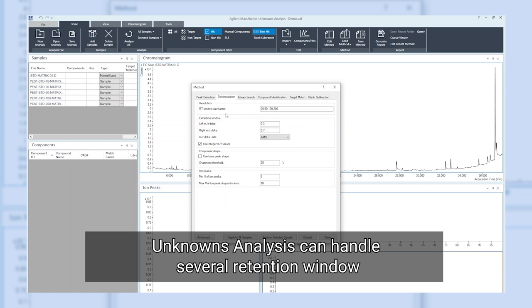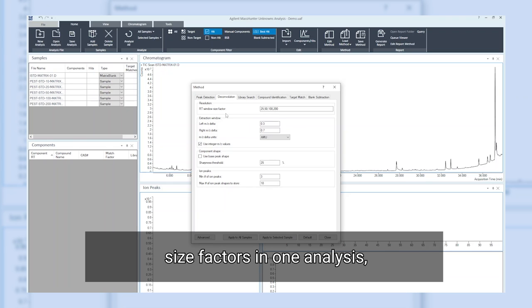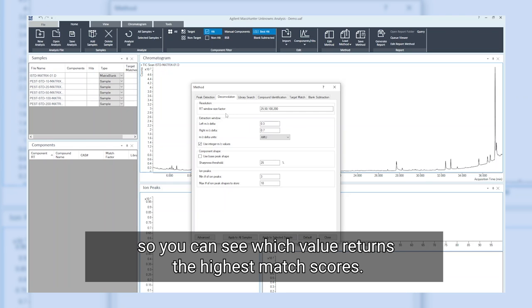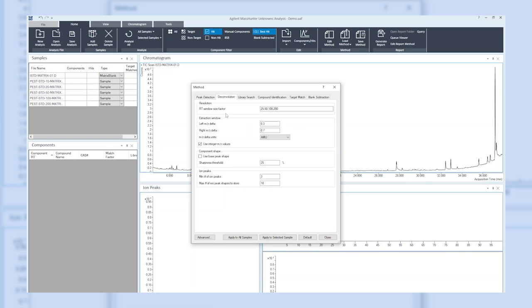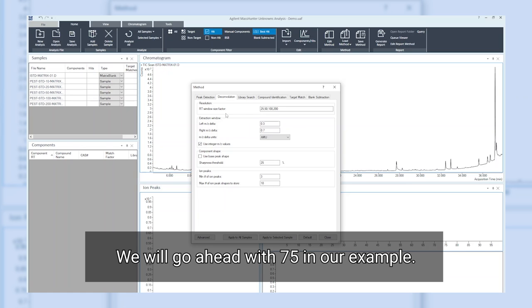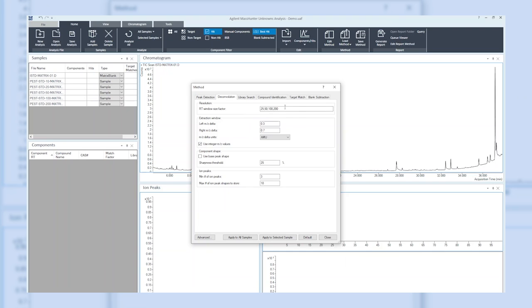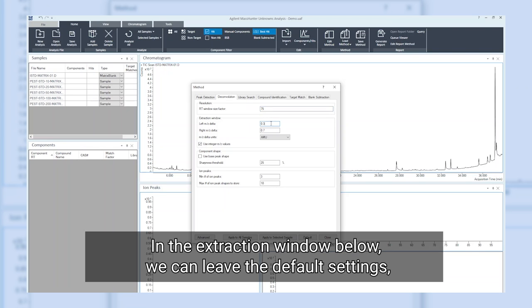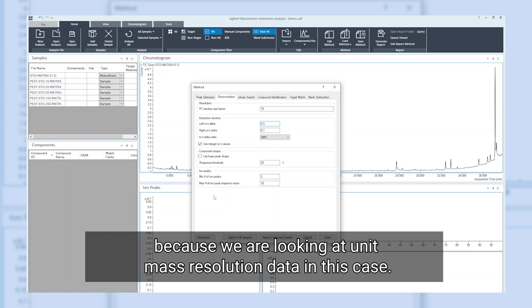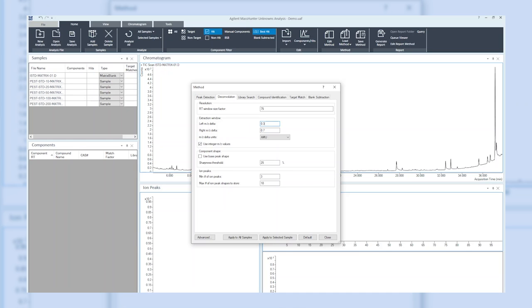Unknowns analysis can handle several retention window size factors in one analysis, so you can see which value returns the highest match scores. We will go ahead with 75 in our example. In the extraction window below, we can leave the default settings because we are looking at unit mass resolution data in this case.